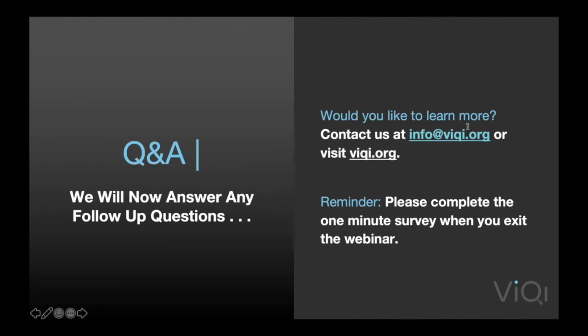So yeah, that's absolutely possible. It's a little bit harder to do with deep learning because you have to figure out where you're going to insert this in the deep learning network. There are ways of doing that also. I would say not standardized ways, but there are approaches to this with deep learning as well.